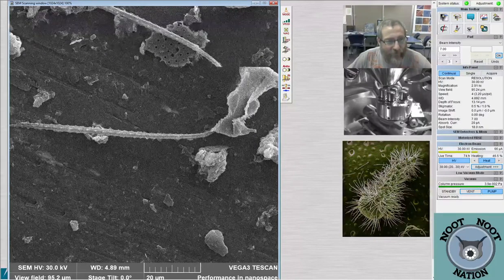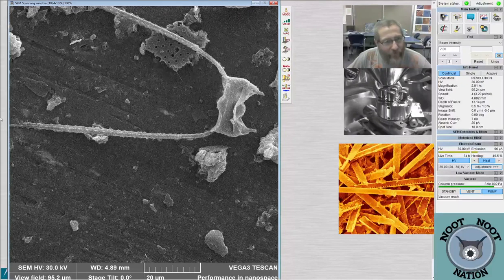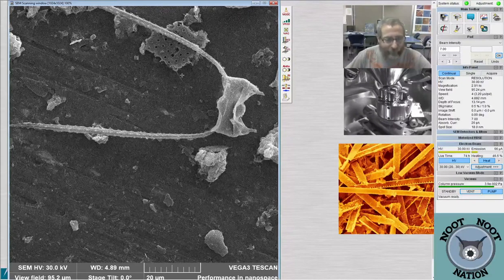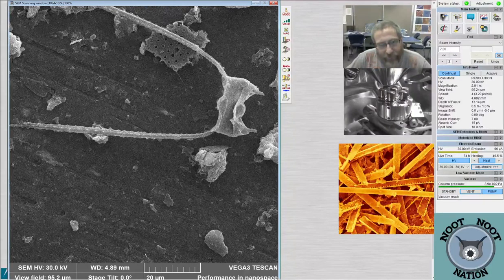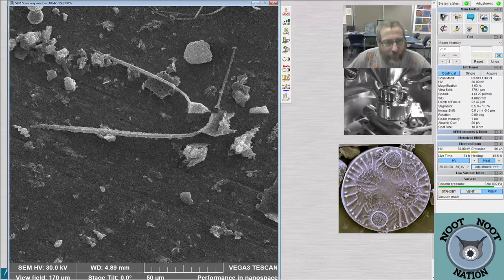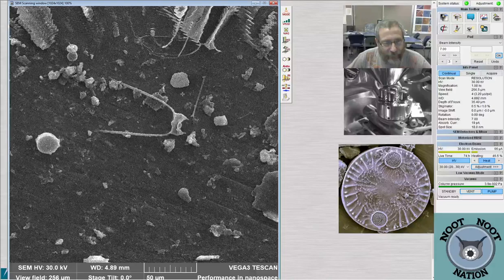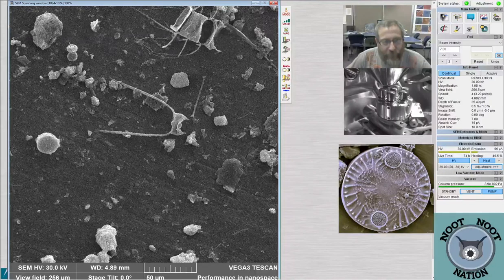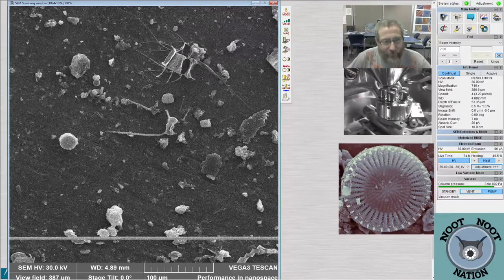But you can see it's got these really long spines. This is an end one. The end ones have long spines that point up or down, and then a little bump in the middle. Yep. Ditylum, probably. It has a little nubbin. And I thought I saw something cool over here, so I'm zooming out until I see it. Ah, yeah, here they are.